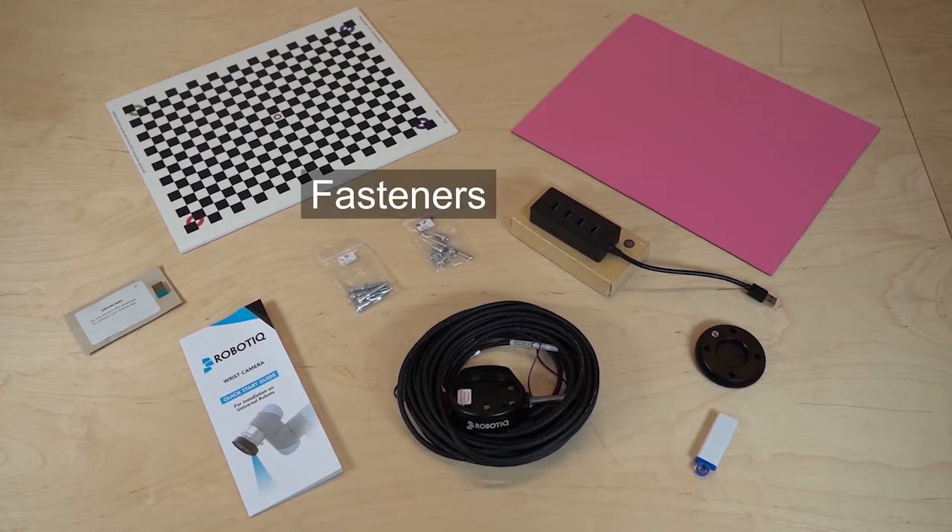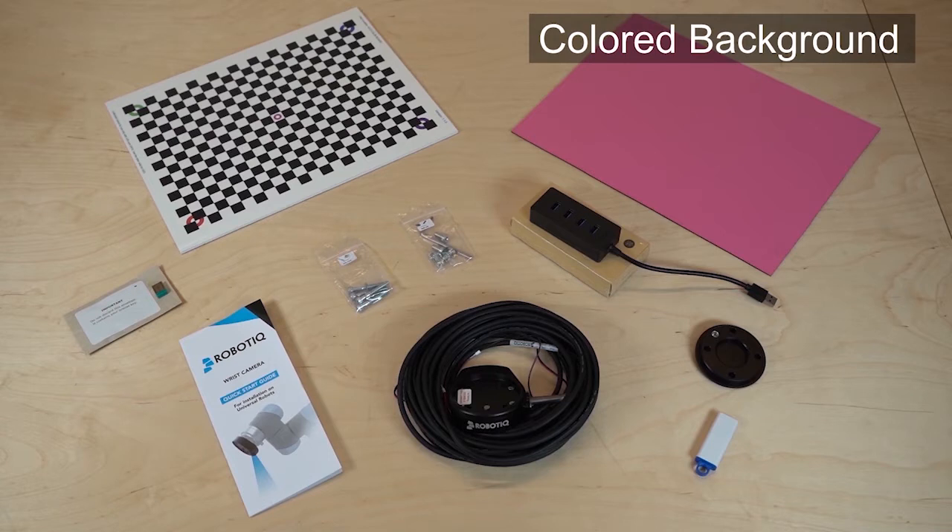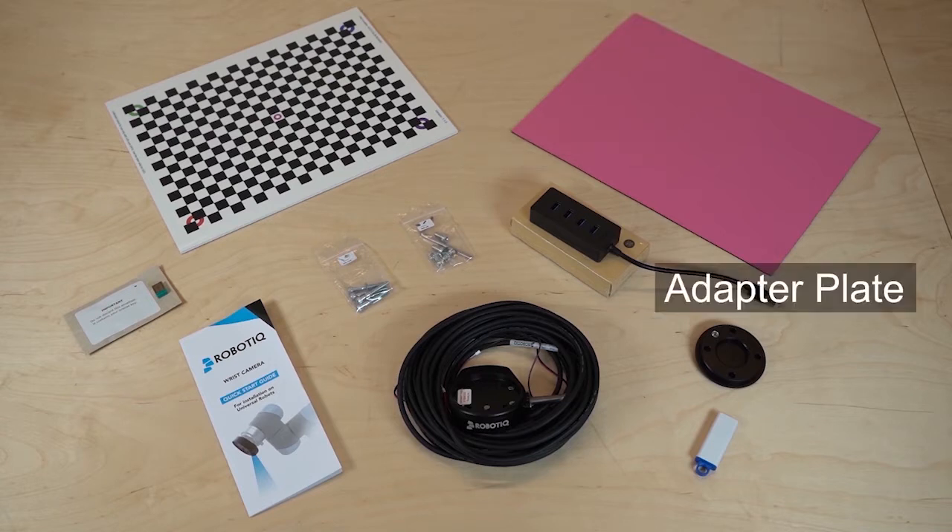The USB license dongle is essential to the activation and use of your product. Under no circumstances should the user discard the license dongle.